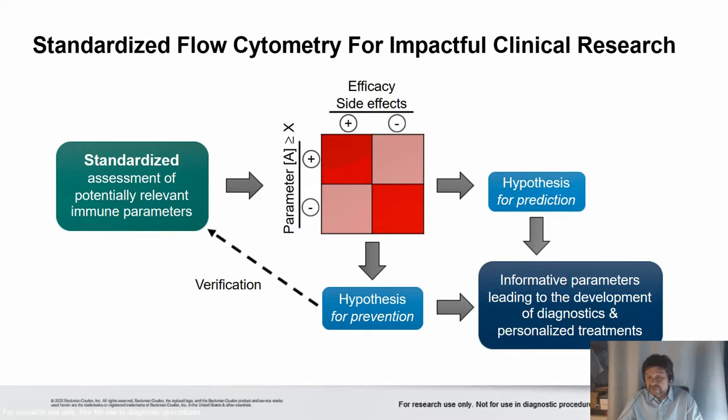On the other side, you might also get into the situation that you can articulate a hypothesis to prevent side effects, which in turn then could be verified by adding new data sets from the same standardized method, so that the correlation between these things that you are speculating about can be really proven. And that is what impactful clinical research is about, that you end up with something that can be really applied and that could lead to clinical development, development of diagnostics, personalized treatments.